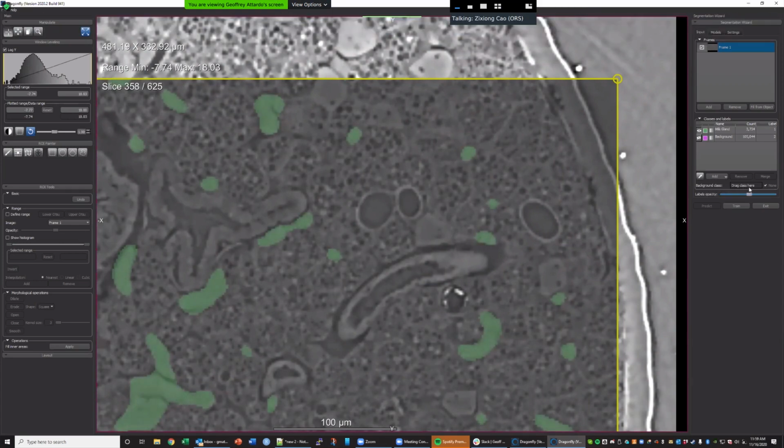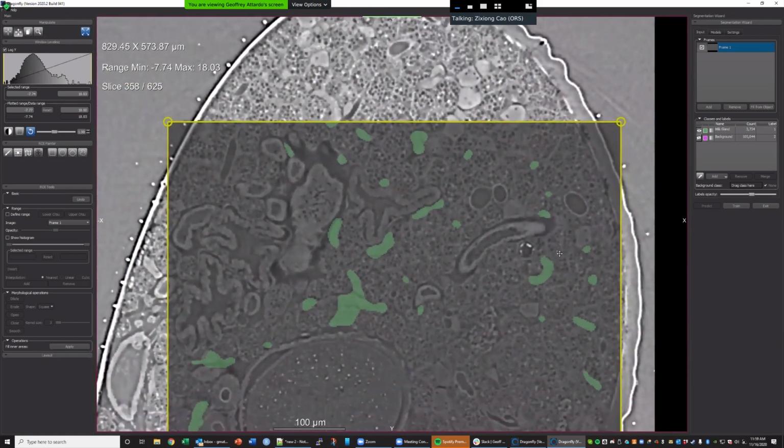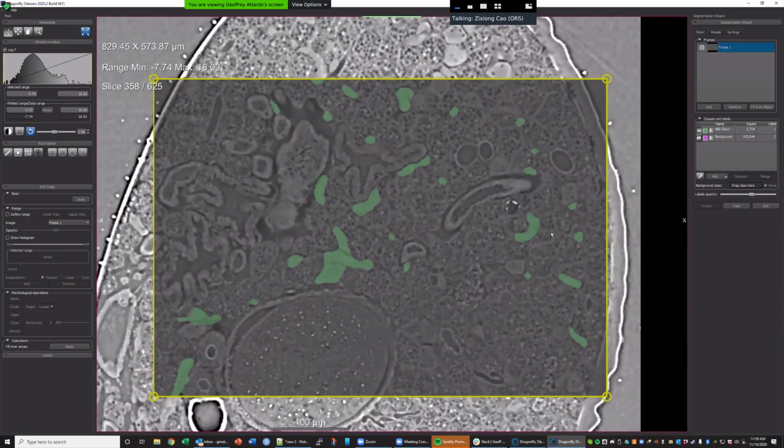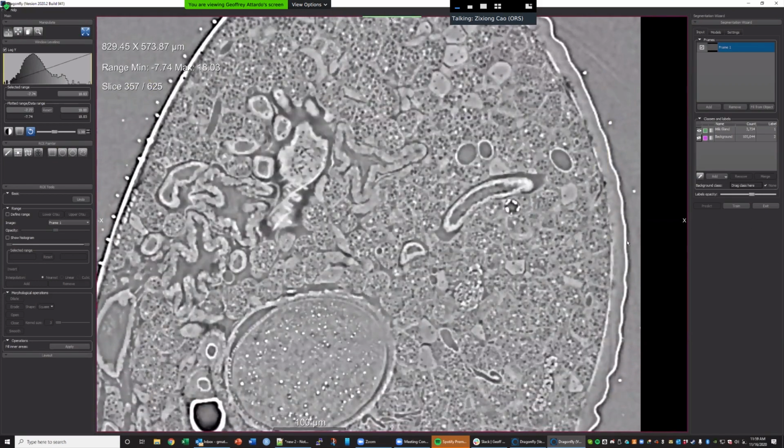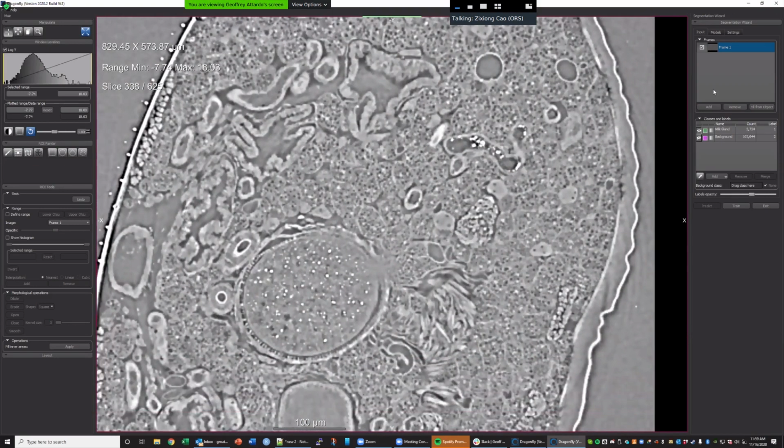Okay, I think we still can work from here. Just to make sure it trained a model that does some predictions. And we can move a little bit and create another frame. Can you do that? Create another frame and fill the frame.